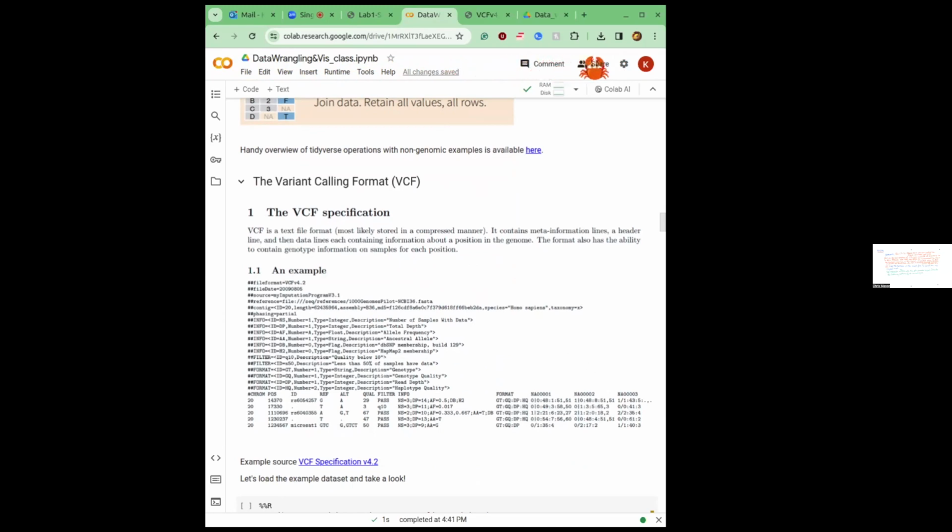So if you went through the first part, or you will finish it in the future, you probably ended up at the SAM/BAM level. So this is the aligned reads level. After having aligned reads, usually you would align them to the reference genome. Sometimes you can align them de novo. Since we are talking about very long reads, like Chris mentioned last time, how you would use de novo alignment and long reads would be probably sequencing the same genome with short reads and long reads, and then creating contigs with long reads that you then polish with short reads to create new genome assemblies. So that's the side note on the BAM side.